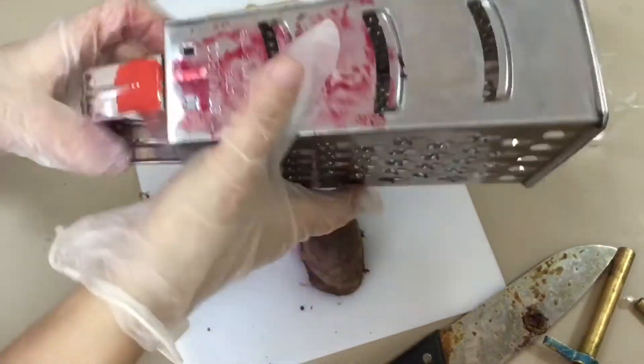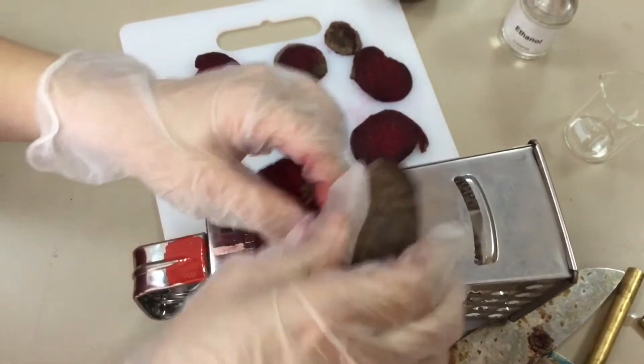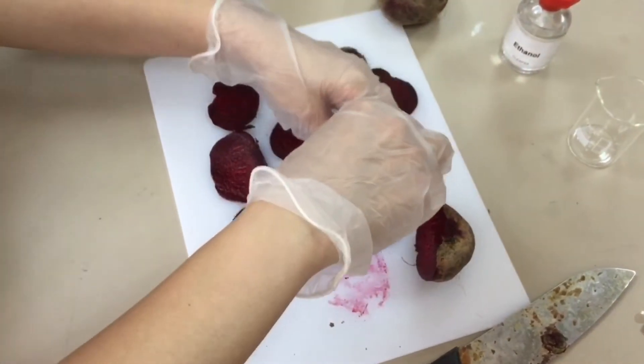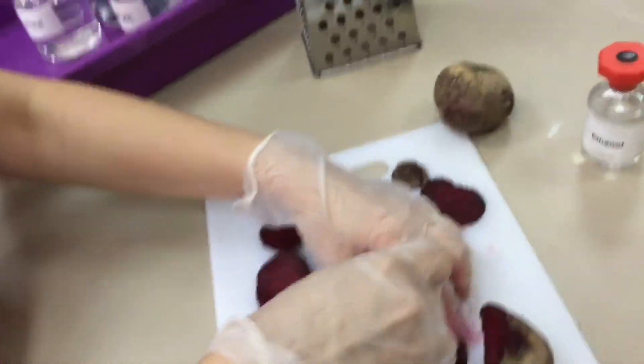We can then decant the alcohol containing the pigment and we can use a colorimeter and measure the absorbance through it, and that will give us an idea of how leaky those cells have become.